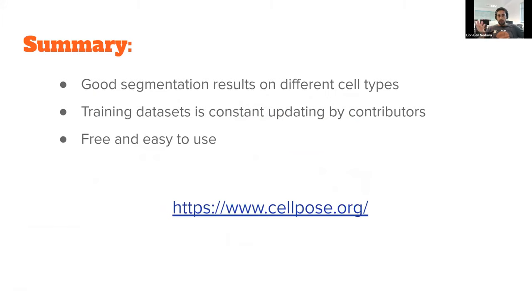To conclude, Cellpose is a very good segmentation algorithm, and you can use it off the shelf. You don't need any retraining. They have a free and easy to use model online on the website. You can just upload your images and it will segment them. It's constantly updating and training from contributions made by other users. They have a special GUI where you can label your own data if the results are not good enough, and then you can upload these images and contribute to the entire Cellpose model. That's it. I used it a little bit. It has good results off the shelf.